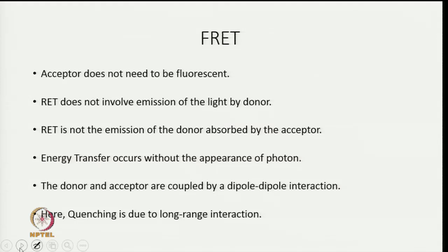There are some very important points about FRET. The acceptor does not need to be fluorescent; the donor needs to be fluorescent, but the acceptor can be fluorescent or non-fluorescent. FRET does not involve emission of light by the donor. So please keep in mind that it does not involve emission of light by the donor.